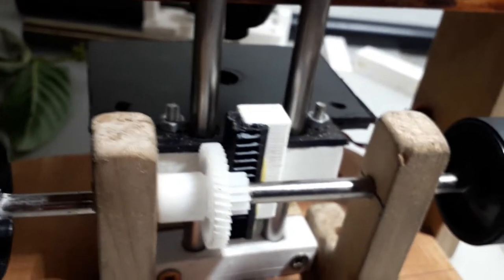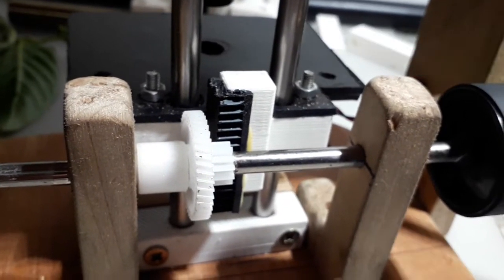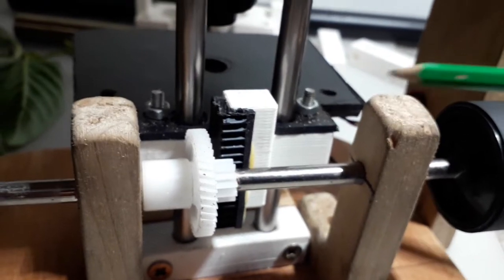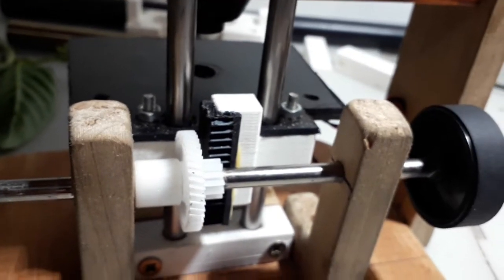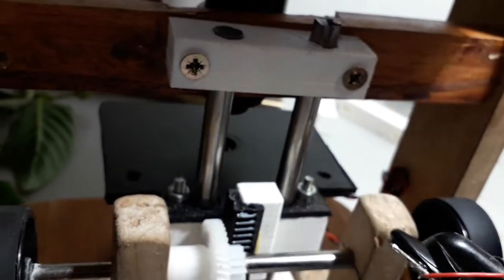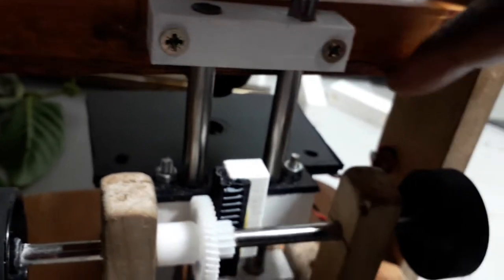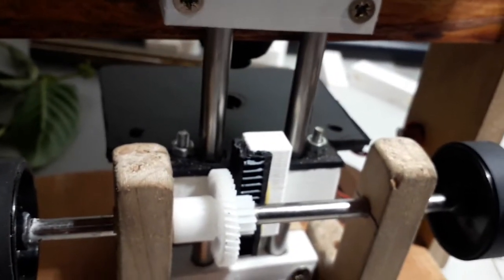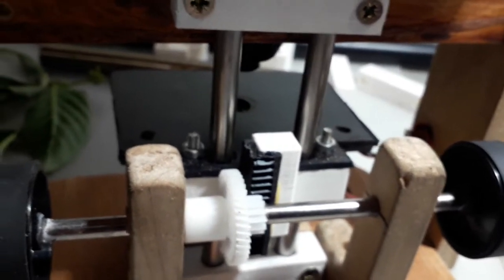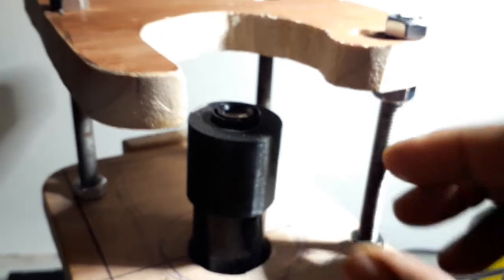I also took a piece of plastic to make a hole in there for the light source. I have an LED light coming from under, and I also made a light that can come from on top. I need to put some lights up there, but I can still use this light though. I need to make some sort of LED light rail for on top when I'm watching the surfaces and not through a specimen.